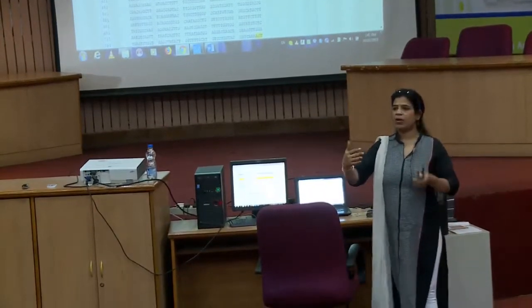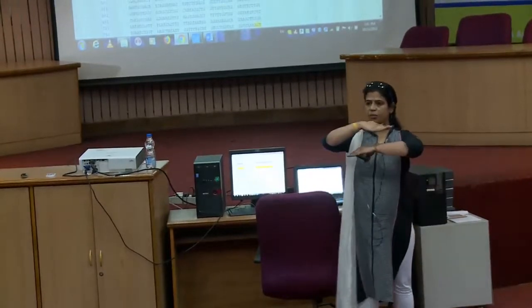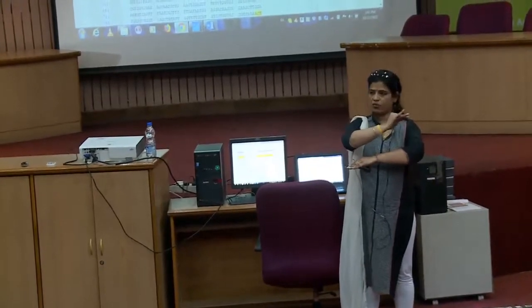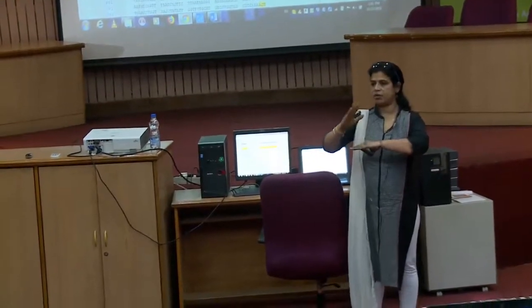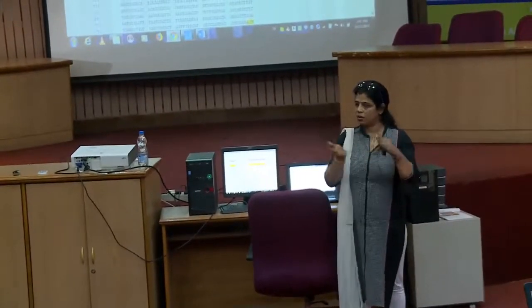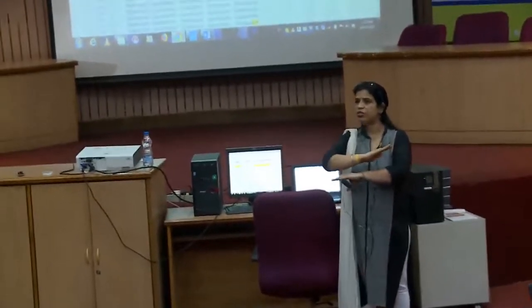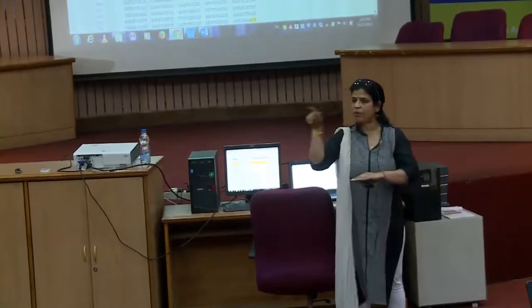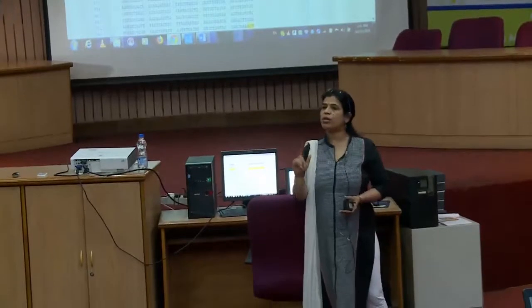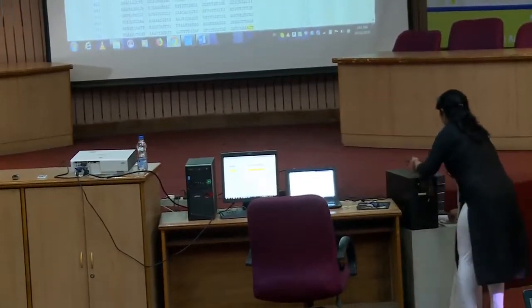Let us suppose you have a template. You know the template is double stranded only, right. So your primer is designed, with the forward somewhere here and the reverse somewhere here. Both the strands are reverse complementary of each other, correct. One is 5' to 3', another is 3' to 5'. So the primer should also be in that orientation only. Can I have one? Okay, I will just show you how it works.